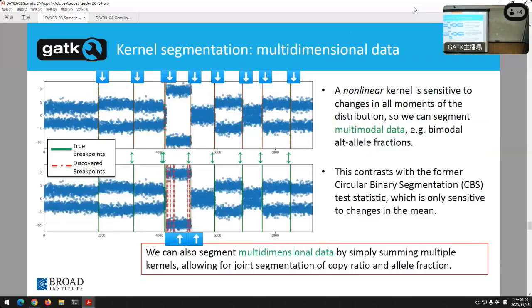All right. Now here's the hardest part. The important thing here is that in those pictures, you didn't have a lot of resolution at the ends. I couldn't tell you exactly. So we showed you some easy ones where all of chromosome 7 was duplicated, but clearly it's not always true that all of the chromosome is. You want to get the breakpoint. You want to know where that ends. And that's what the segmentation is, figuring out where the pieces are.